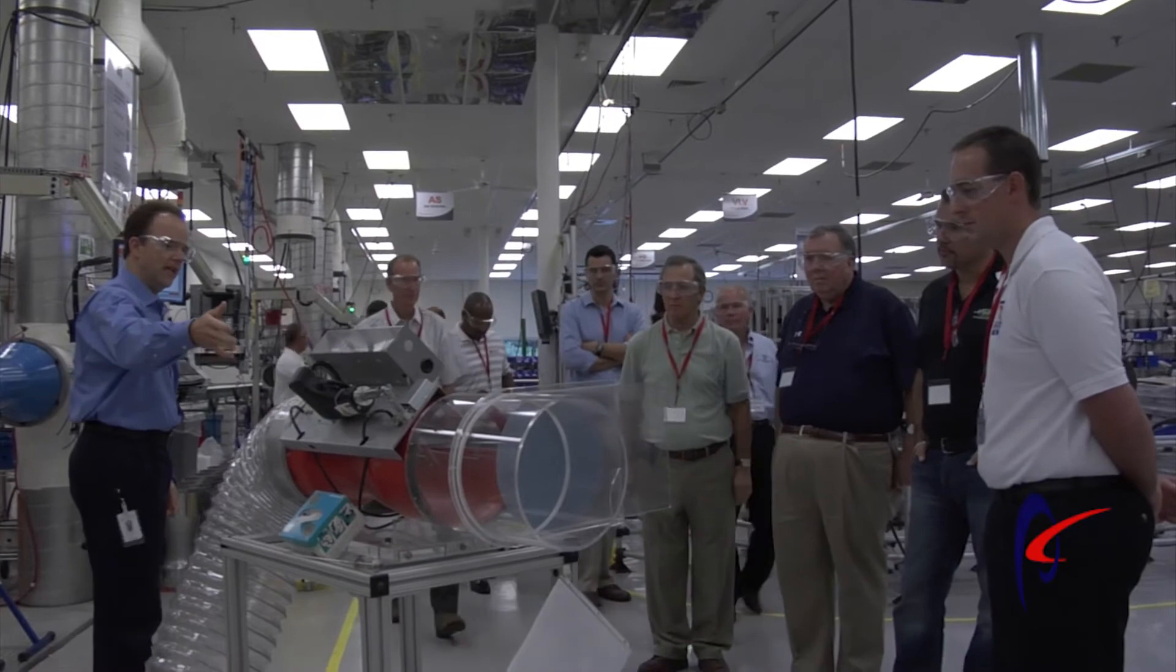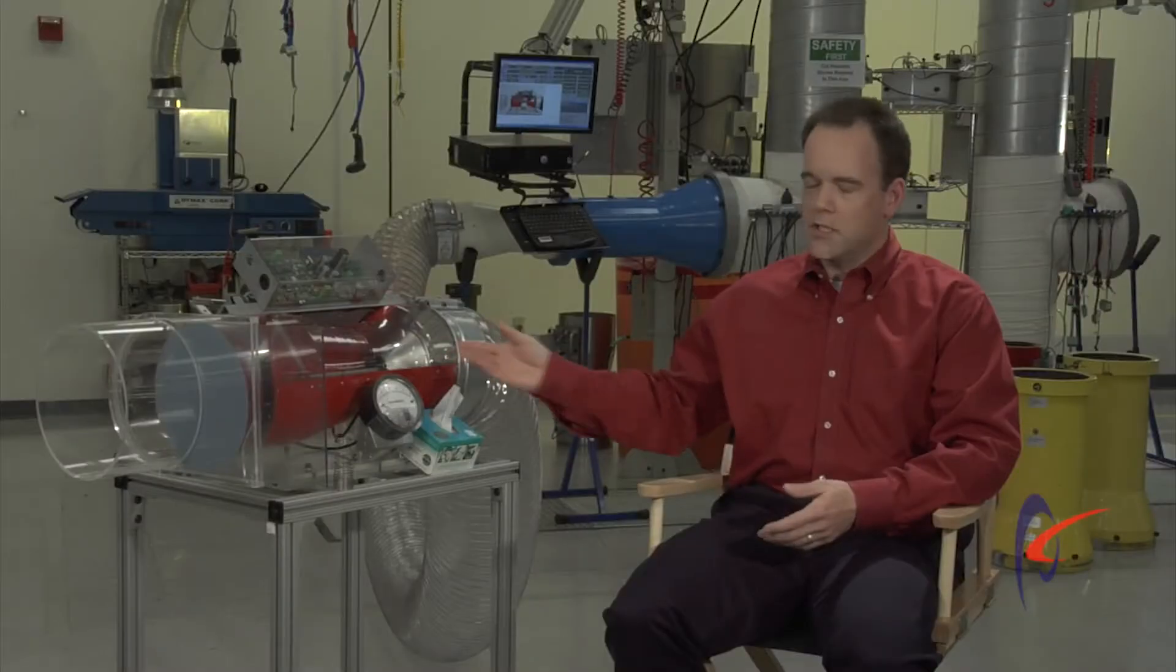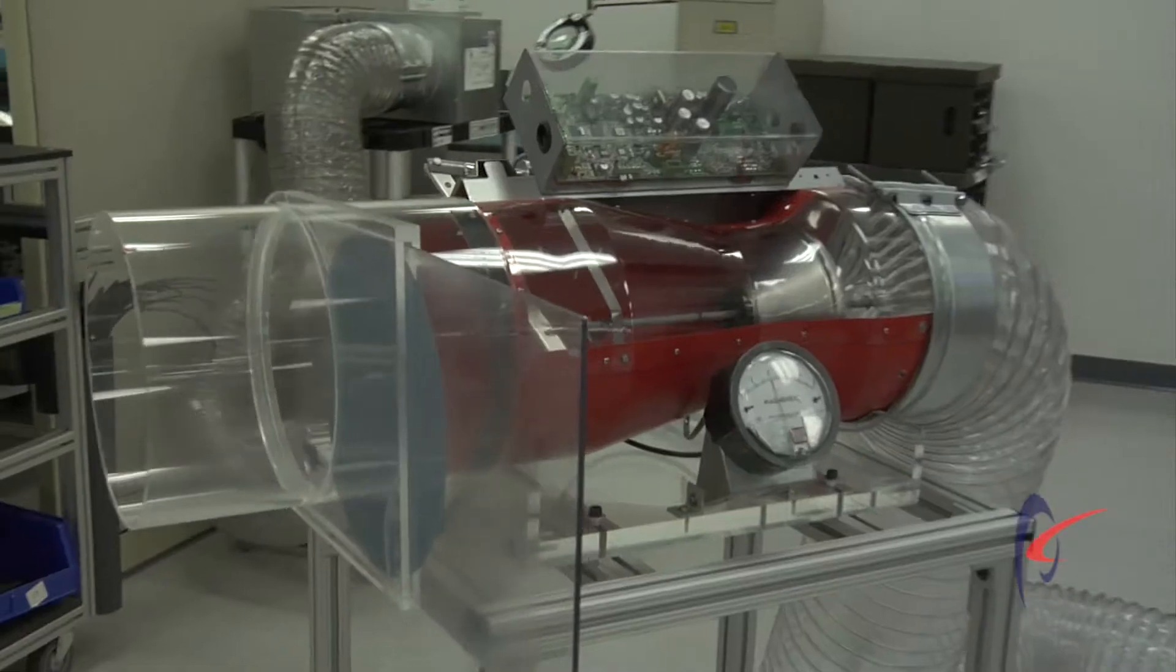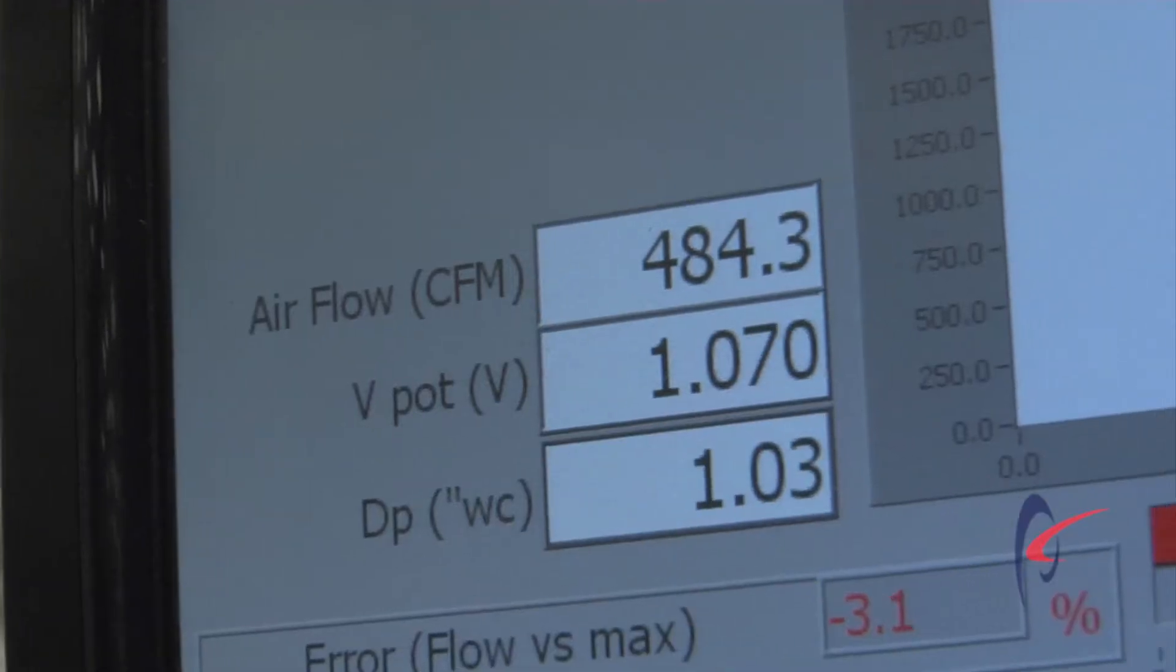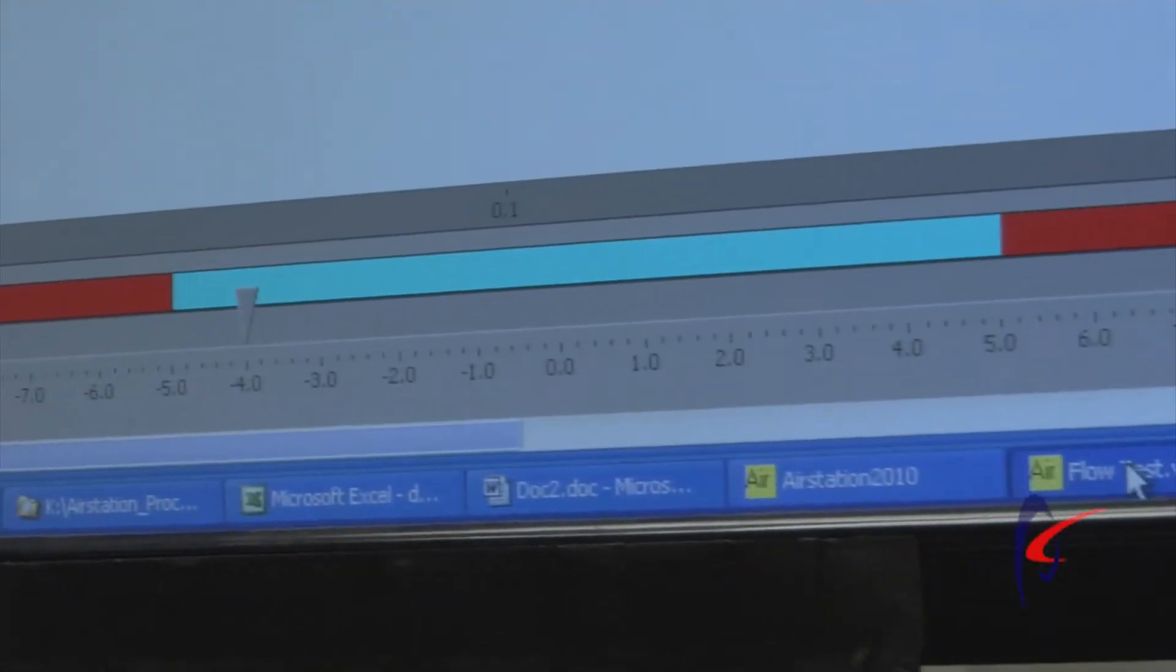Hi, my name is Ken Crooks. I'm a sales engineer here at Phoenix Controls. I support our sales channel and our customers. When customers come to visit the factory, one of the important things we do is show them the red valve demo. It's an operational valve with a clear plexiglass cover so you can witness firsthand the mechanical pressure independence characteristic of the Phoenix valve.